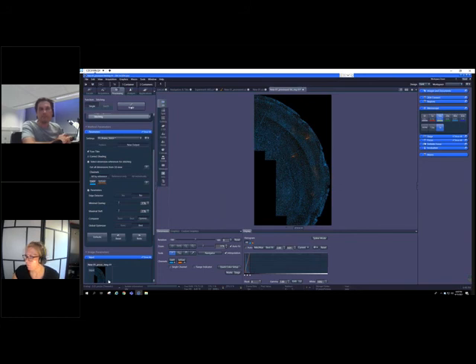So basically we are calculating the blur information from our focus image. And those two convolved images are being subtracted from our original image using a nearest neighbor algorithm. So it's a very straightforward algorithm. And by the way, we provide this deblurring algorithm already within our Zen Lite version. So with our free version of Zen, you can directly use this deblurring functionality.